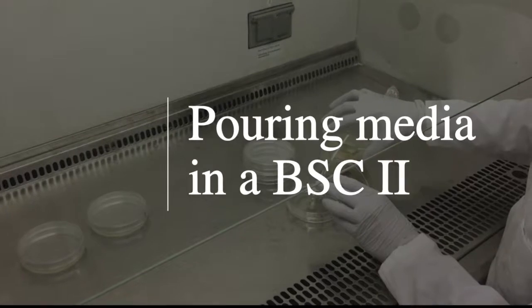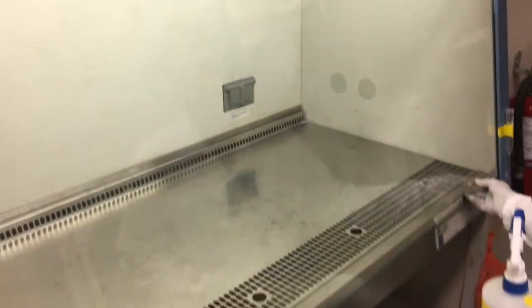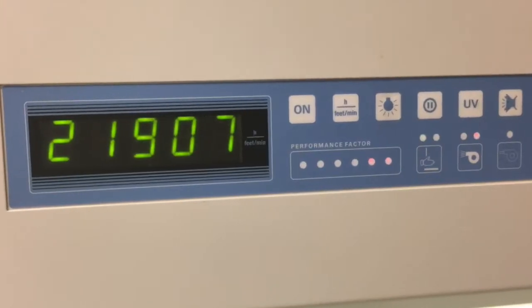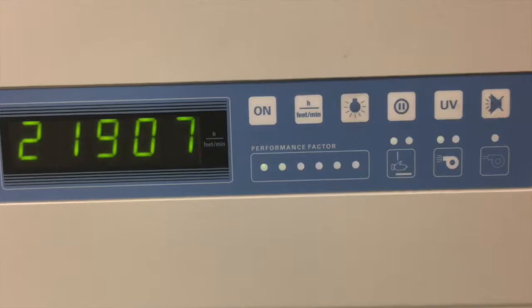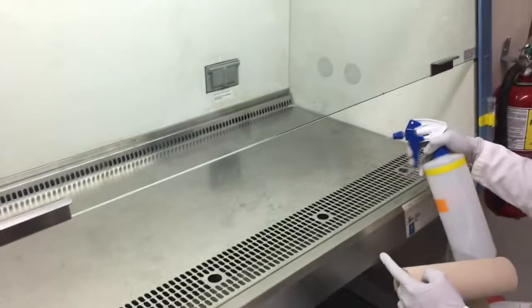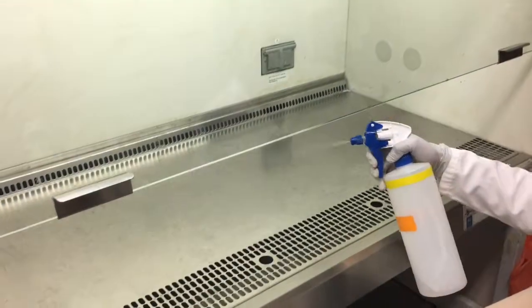Some people prefer to pour their media within a biosafety cabinet. Lift the sash to the operating height and wait for the airflow to stabilize. This model has indicator lights that change from red to green when the cabinet is ready for use. Spray the surface of the cabinet with 70% ethanol before beginning.